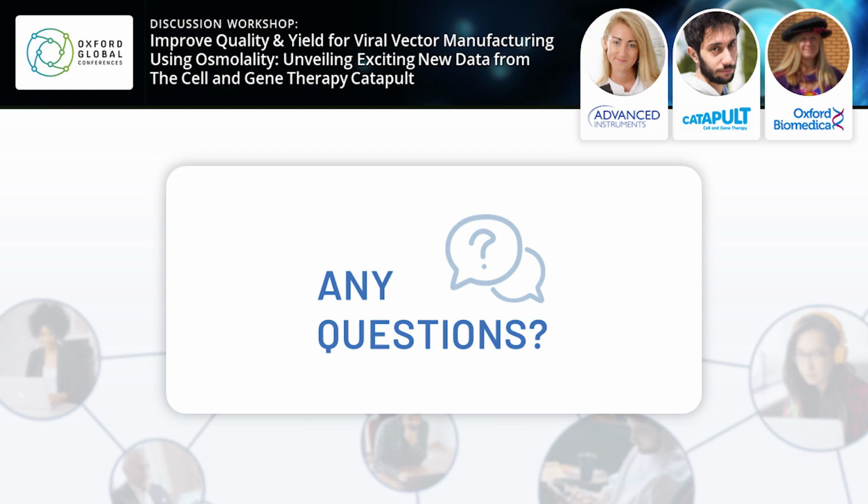Okay, so I think there's a second question that's come in for myself. I'm not sure about Adrian and Lucia, but a question came in regarding cryopreservative formulations, and how do our osmometers actually measure these more viscous samples with components such as high PEG and/or mRNA.